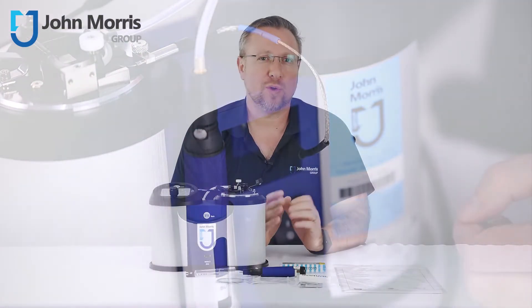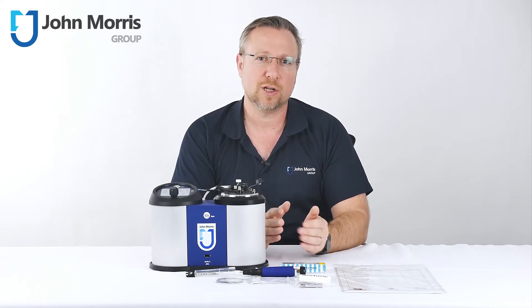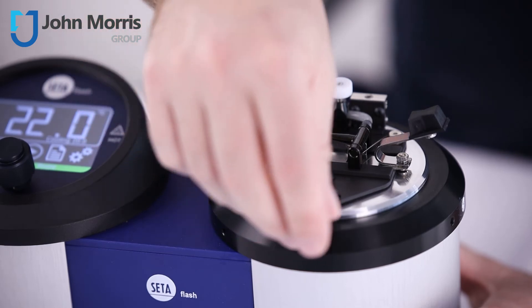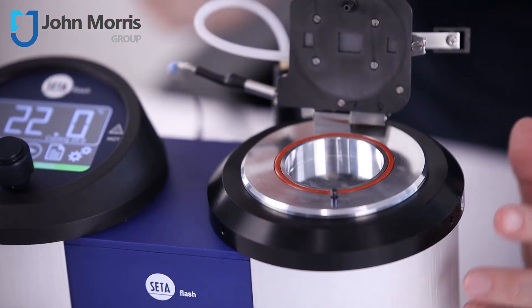The Series 3 is available with electric or gas ignition, and there is a cooled version for precision at lower temperatures or for higher throughputs. There's also a corrosion-resistant stainless steel sample cup for samples that require it, and average testing time is around two minutes, and you'll need between two to four mils of sample per test.